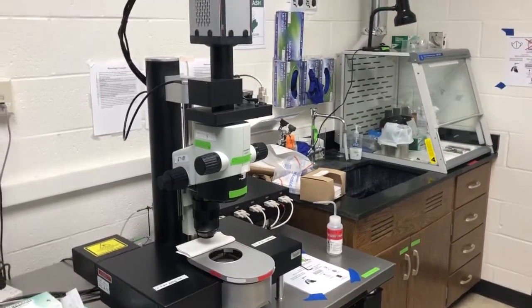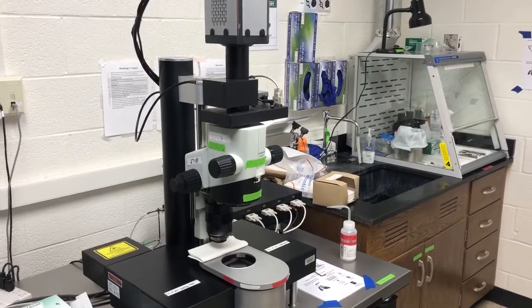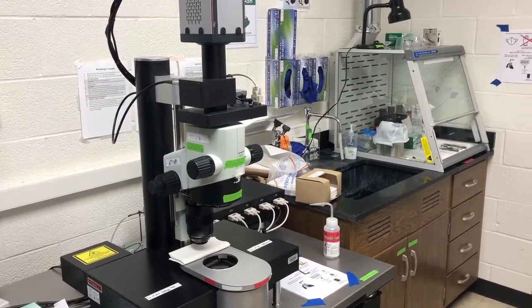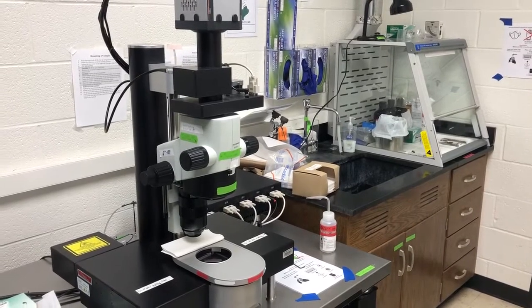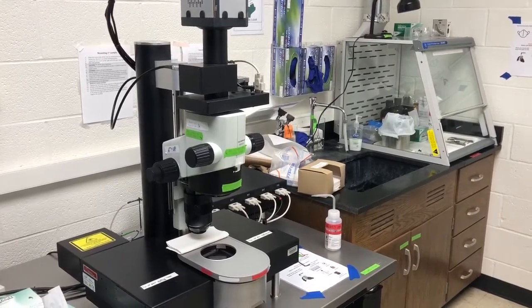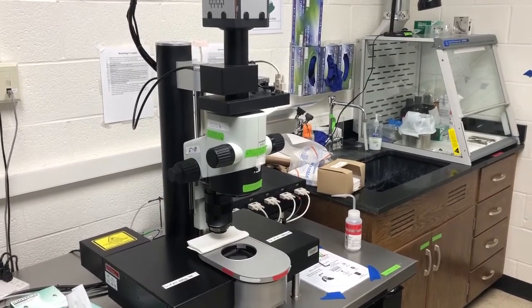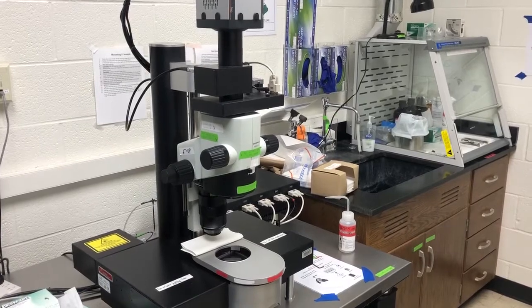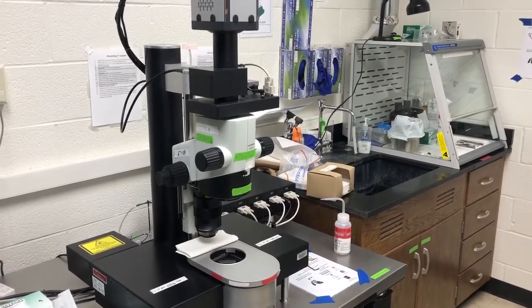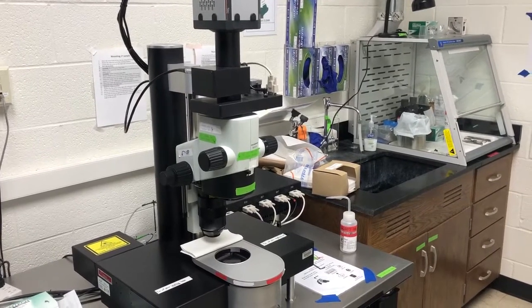Hi everyone. This is going to be a tutorial video for how to use the light sheet microscope in the Microscopy Services Lab. We'll go over how to use proper protective equipment, how to turn the system on safely, what some of the risks are in using the system, how to mount samples, how to acquire images, how to move the data, and how to visualize that data and inform decisions about your imaging.